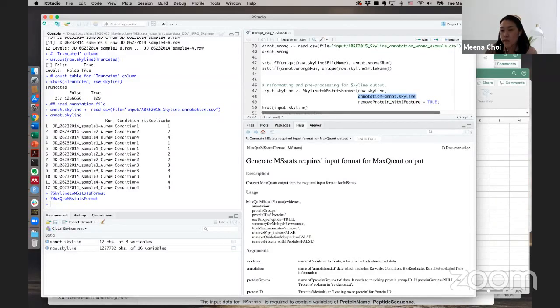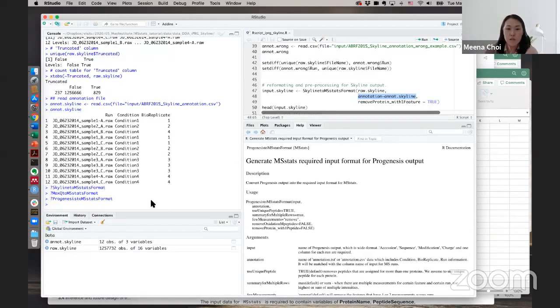For the feature selection part, I will briefly mention the next functions. This one is available from version 3.16, so it has been available for a year. You can use it right now. For Progenesis, one can filter out the common peptides. Yes, this is working. If you check the Progenesis format, you can see the unique peptide true/false option. You can decide this one.